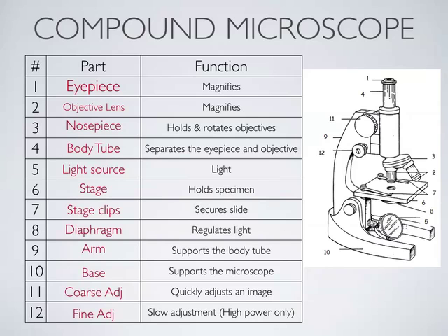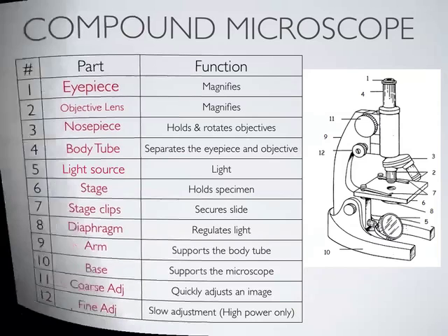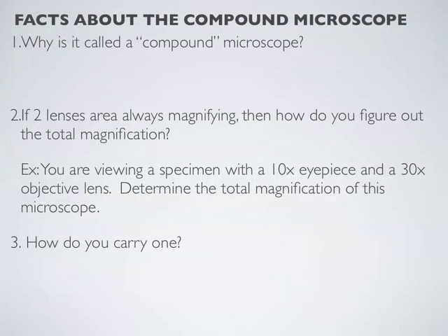Do you ever make it like that? I know what you're asking. You said you can't move it like that. You don't want to move it a lot because you could interfere with what you're seeing. But could you do it slowly? No, you generally just use the fine adjustment. No. All right, so let's talk a little bit here about the microscope.